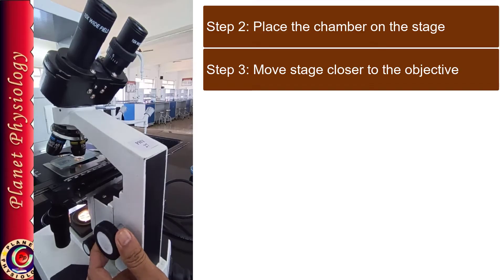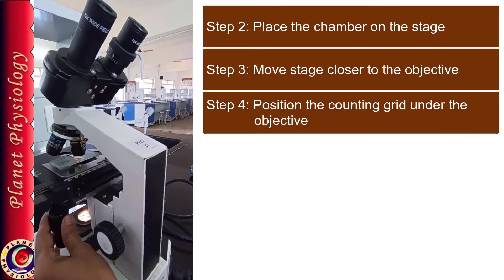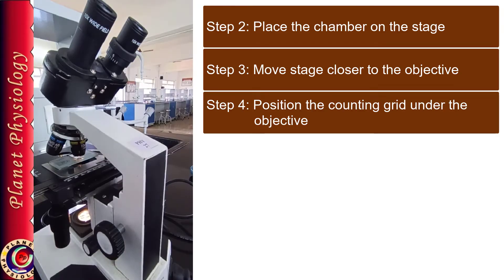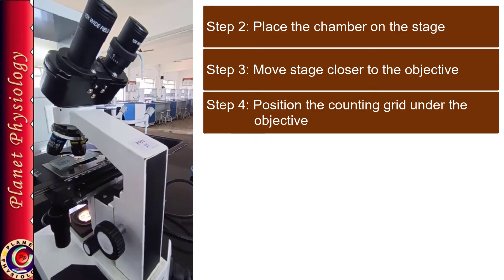Once it is close enough, move the stage in such a way that the central counting grid, what appears like plus sign, that comes approximately under the objective. So all these things you are doing while observing the chamber from this side, you are not using eyepiece till now.